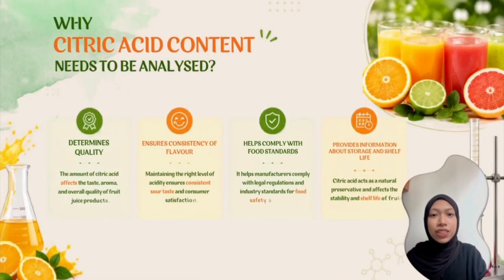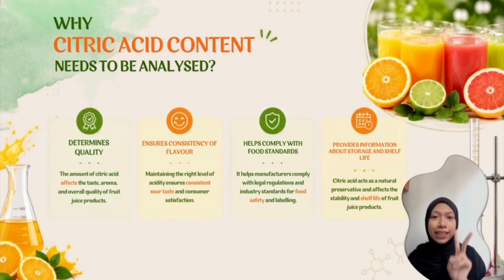Firstly, it is to determine the quality. The amount of citric acid will affect the taste, aroma, and overall quality of fruit juice product. Secondly, it is to ensure the consistency of flavor, which is maintaining the right level of acidity will ensure the consistent sour taste and consumer satisfaction.